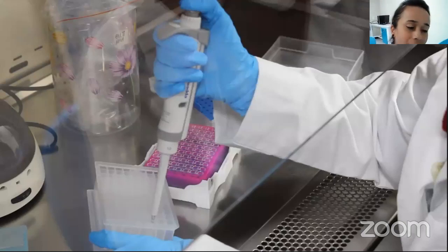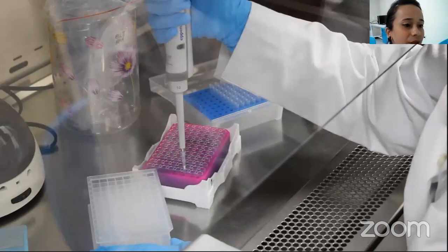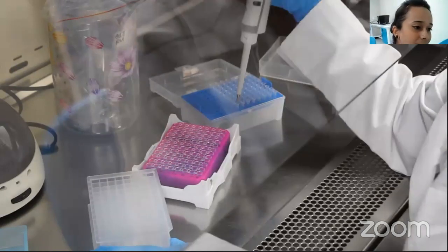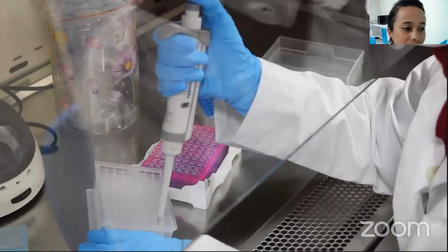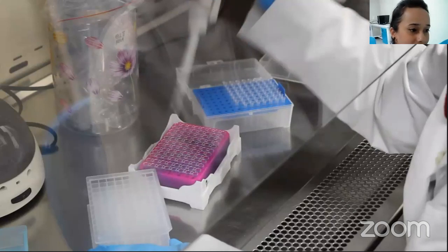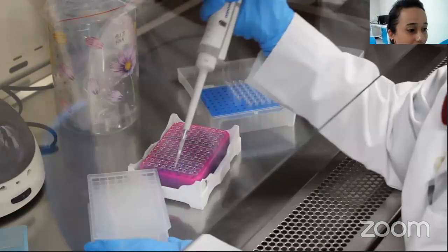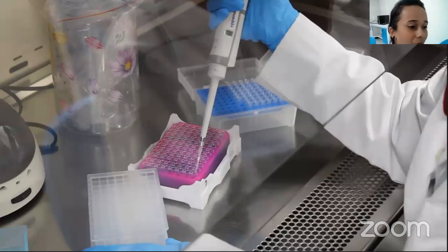Because, as you have seen yesterday, this RNA is extracted on the basis of magnetic beads. Sometimes we actually face a problem that some magnetic beads are present in the well. So what we do is spin that sample and take the supernatant and use it for the PCR. Any accident can happen while you are pipetting the RNA.